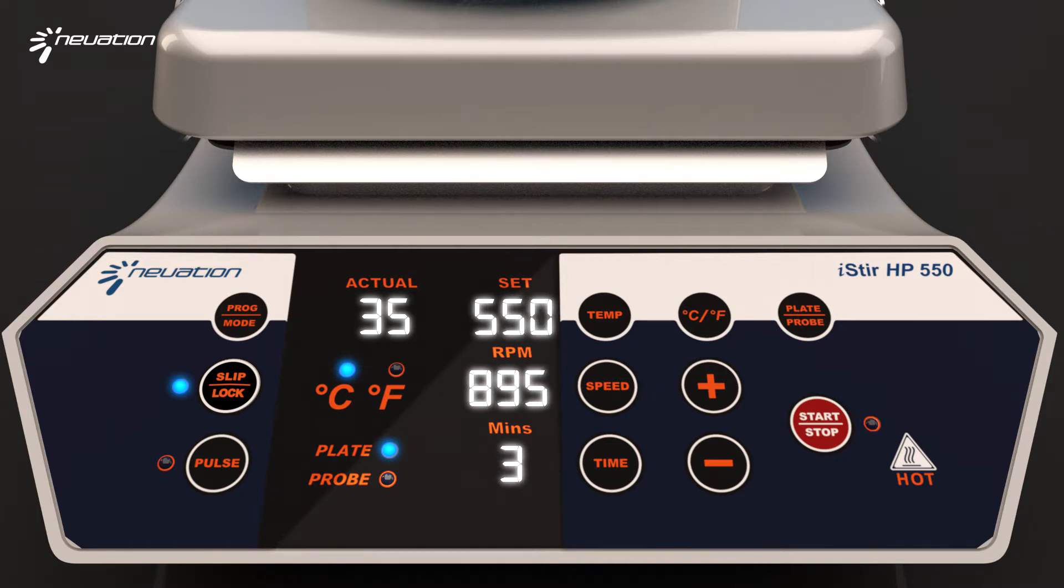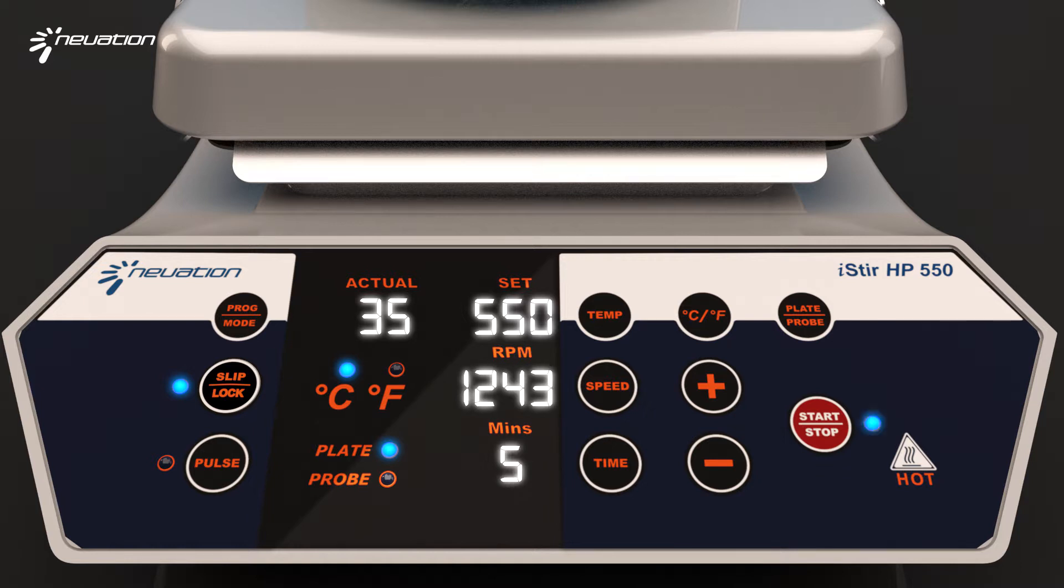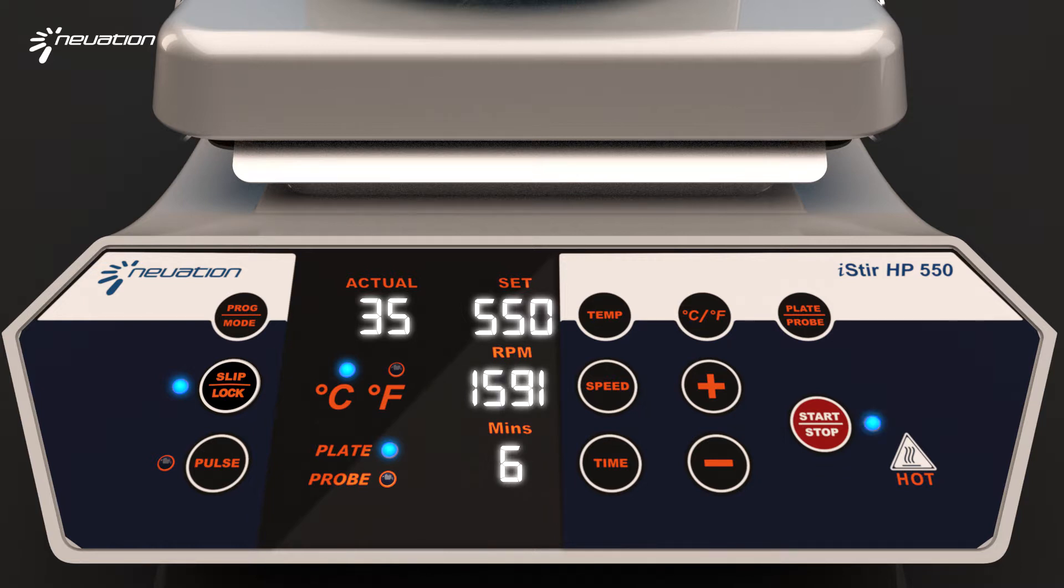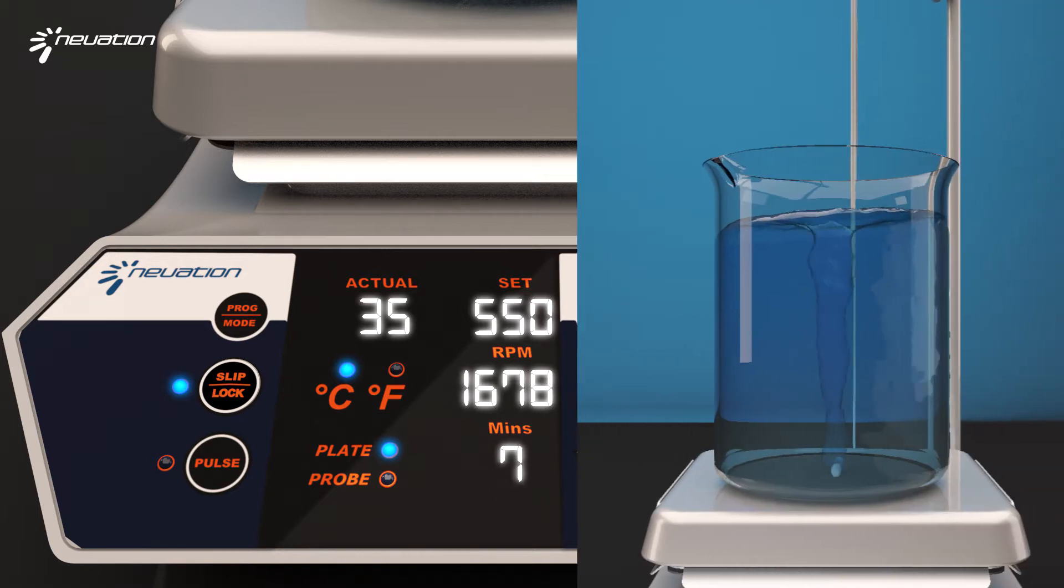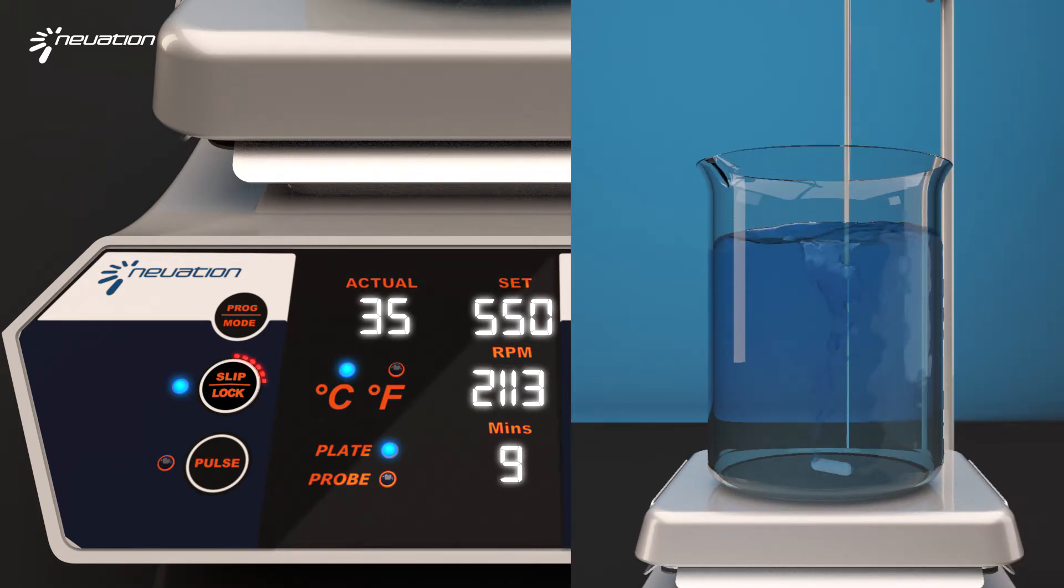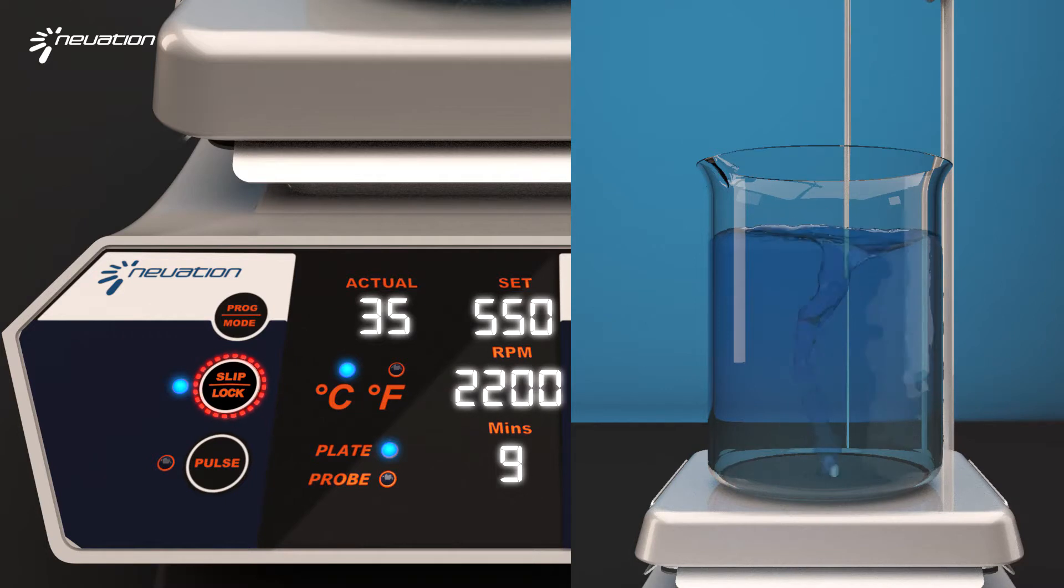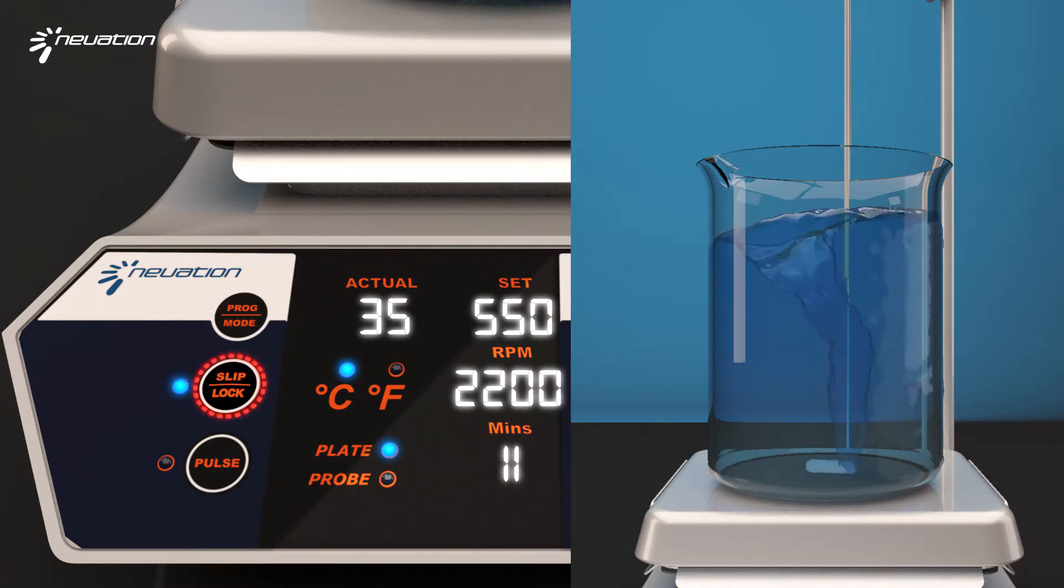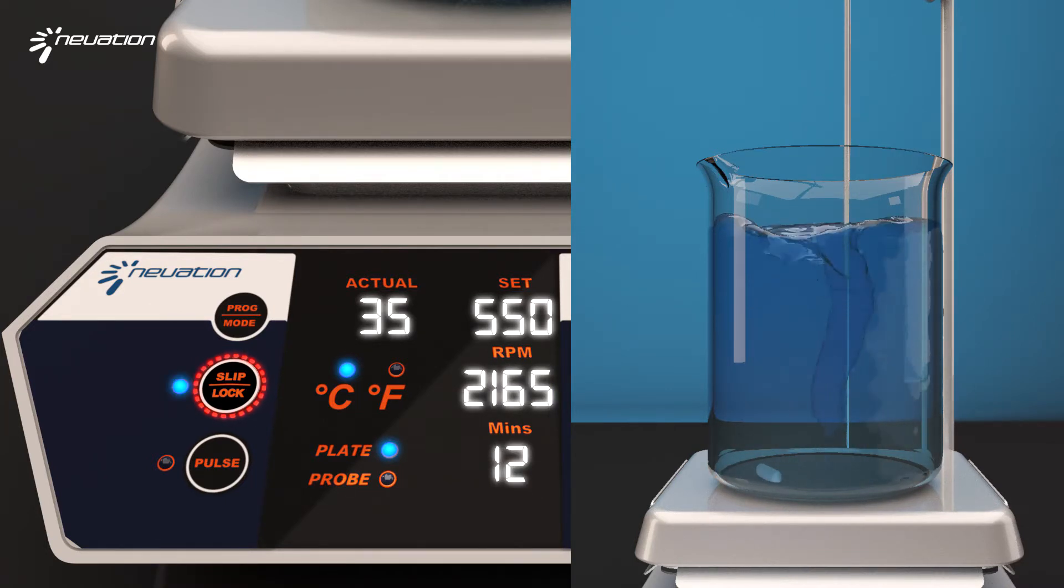This mode ensures that stirring does not stop even with changes in density of the liquid while heating and stirring. I-Stir HP 550's intelligent system detects if the stir bar slips from the center and stops stirring.